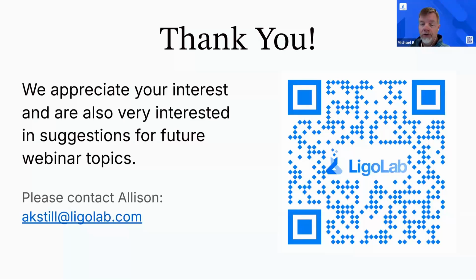The other thing I wanted to mention is the pricing tiers that Olga showed. If you're looking for more information, there is a section on our website, LigoLab.com, where you will find more details. So it's not just a quick slide, but you can really dive in if you want to.